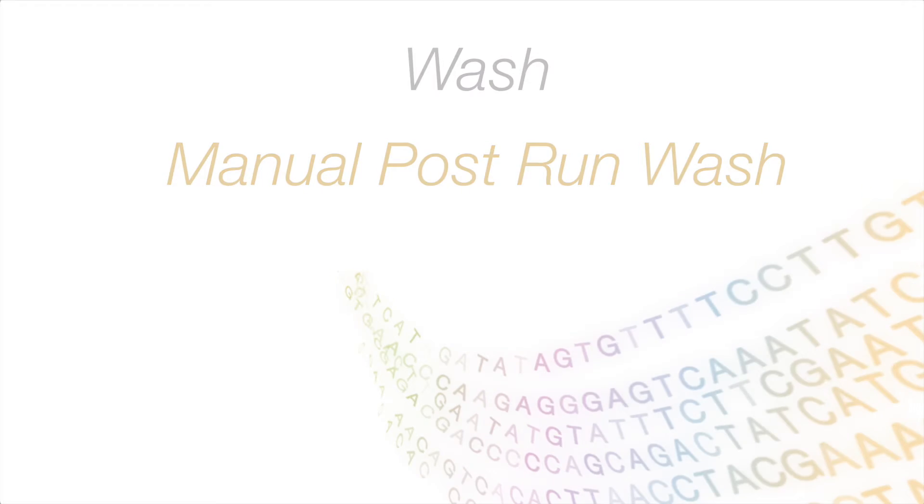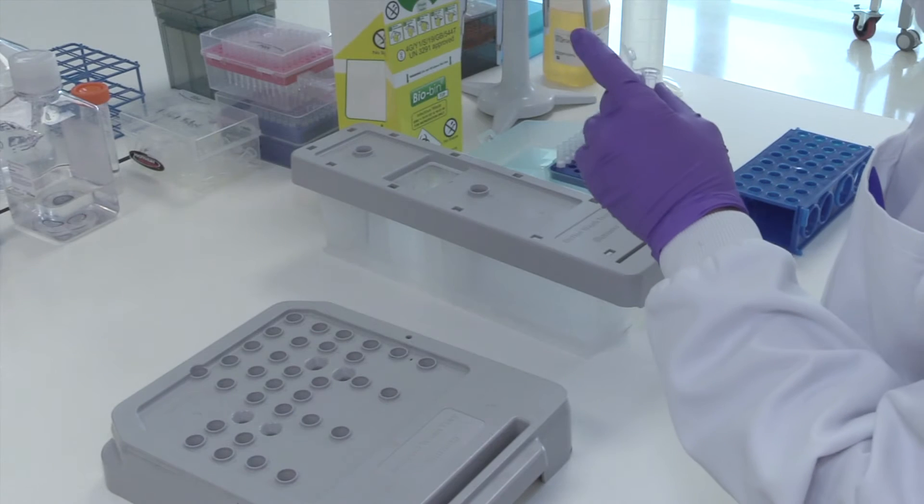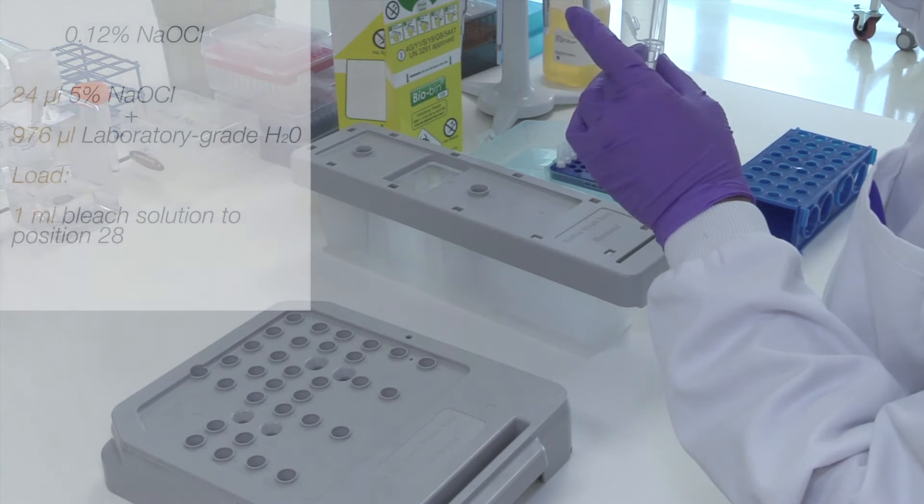How to prepare a manual post run wash. Prepare a 0.05% Tween 20 solution by combining 62 microlitres of non-diluted Tween 20 and 125 millilitres of lab grade water. Load 125 millilitres of this solution into the centre reservoir of the wash buffer cartridge.